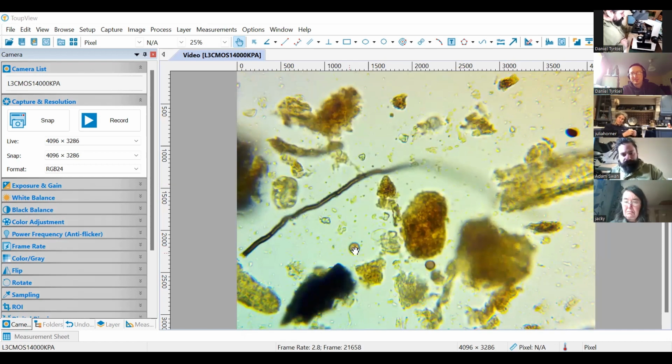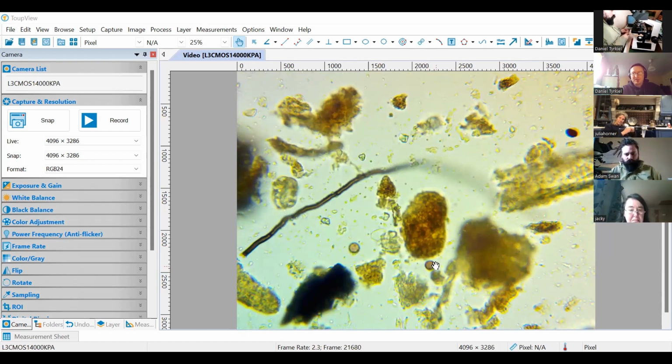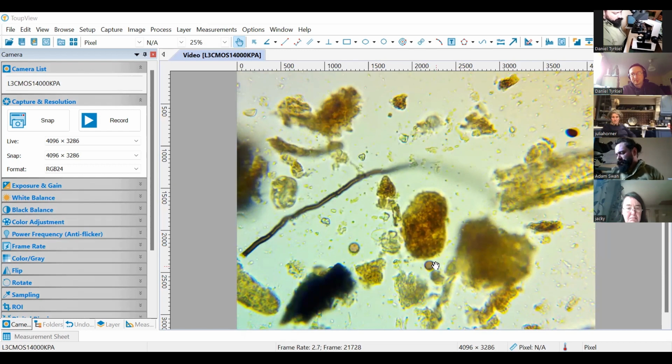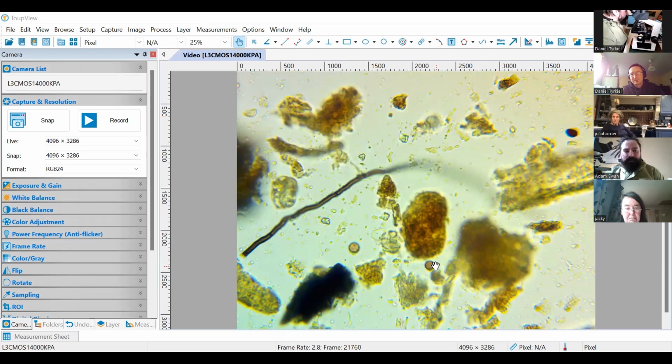This is something that's been promoted by Dr. David Johnson, who says quite a lot that in a 12-month-old compost, you don't see any hyphae, you just see spores. Now, we do see a lot of spores. We also see hyphae. Adam, how old do you think this compost is? Yeah, I mean, some of this is really old. It's a fungal compost. It's over 1.5 years old. Most of it is probably over 2 years old. And there is some hyphae on the screen.